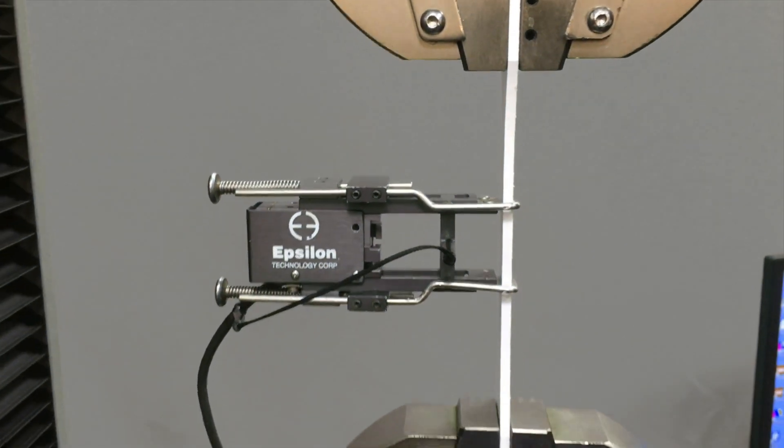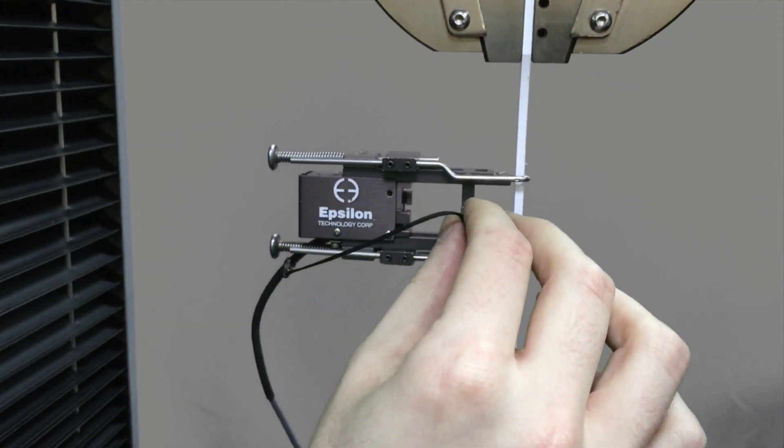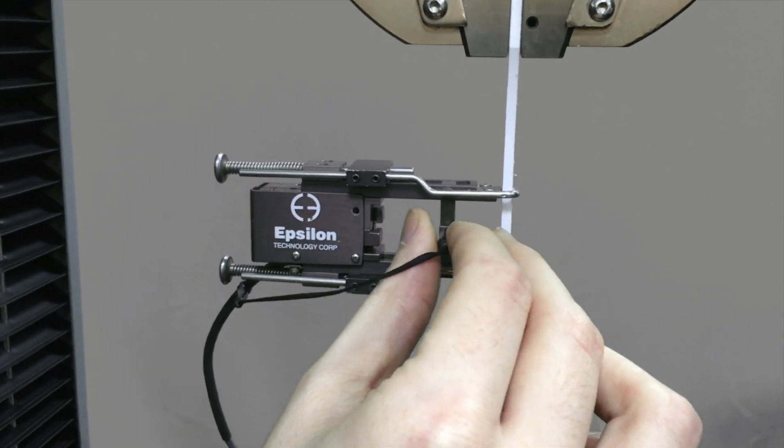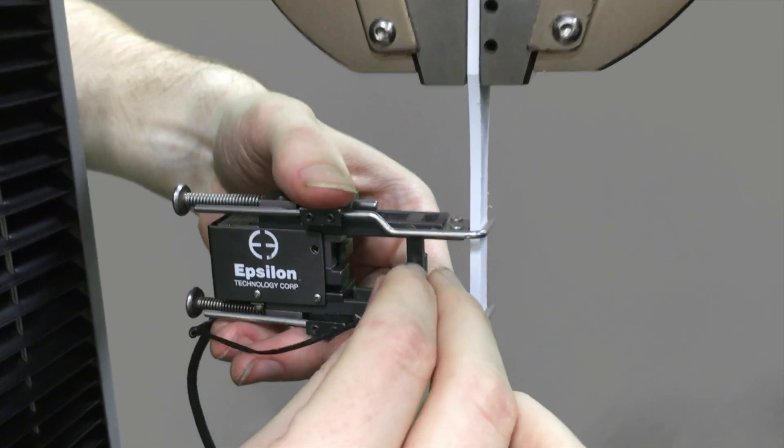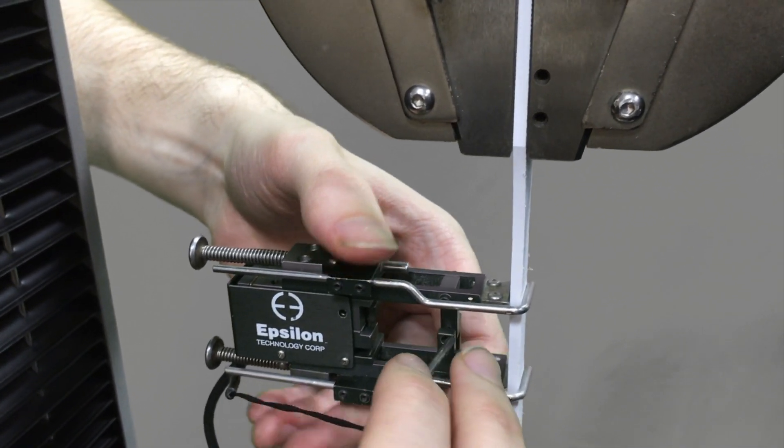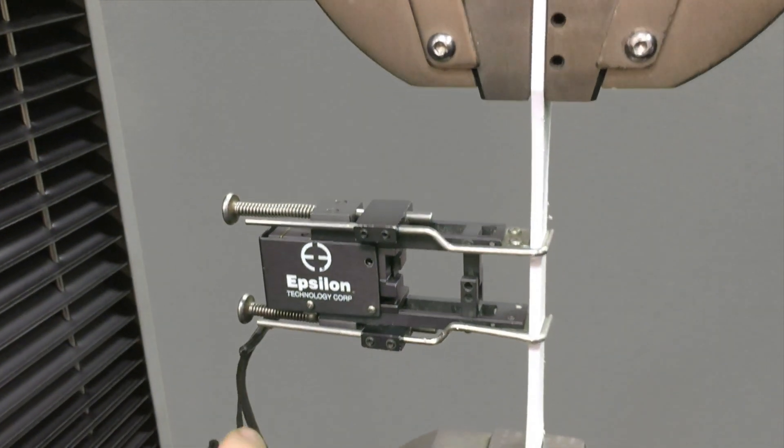Once you've done that, all you're going to do is carefully remove this pin. And now your extensometer is set at the appropriate gauge length.